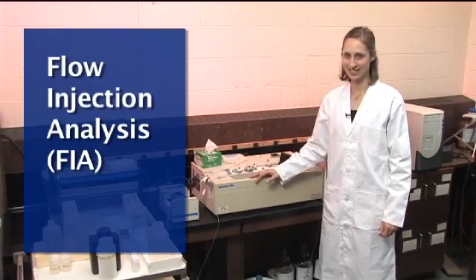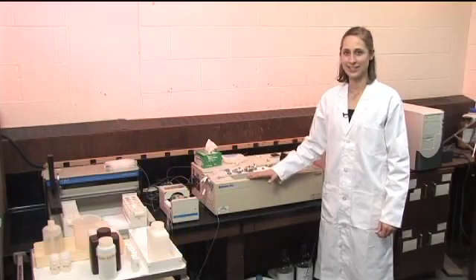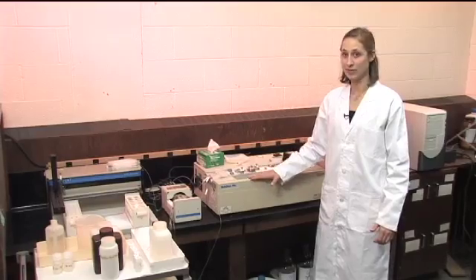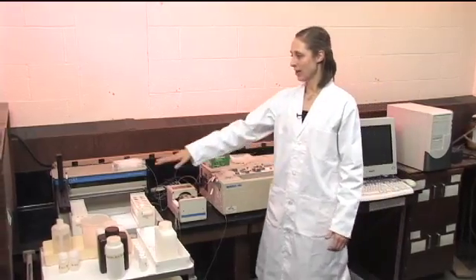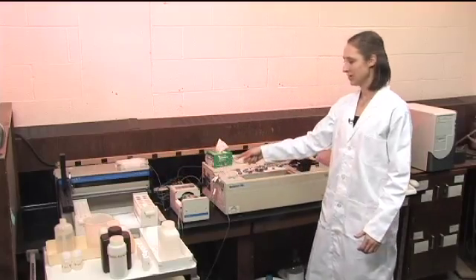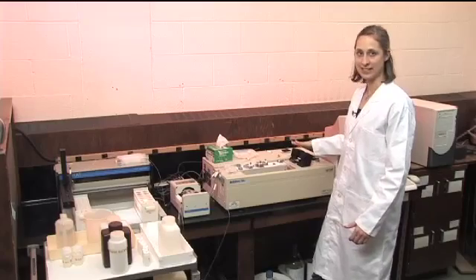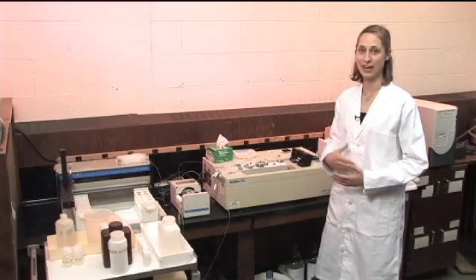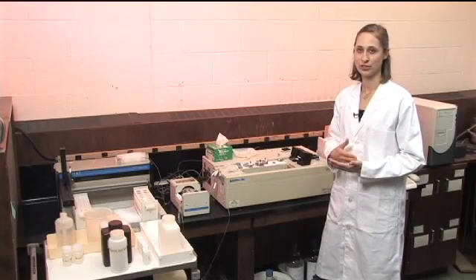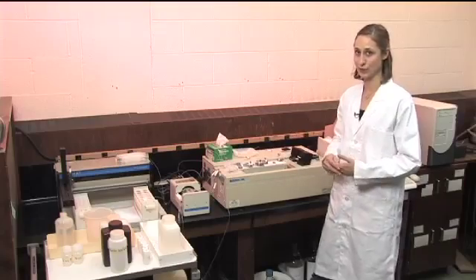This instrument is a flow injection analyzer, or FIA, and what it does is it automates some of the processes associated with normal wet chemistry. It will automatically pick up the samples, mix them with all the reagents, and then this is the detector. As long as what you're analyzing for reacts to form a color that is proportional to the concentration in the solution, you can use this to analyze for it.